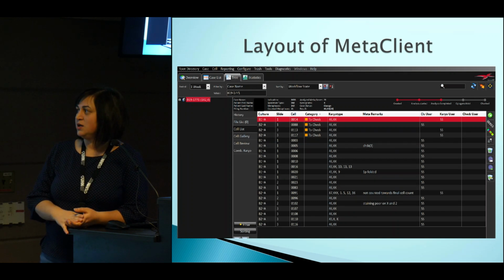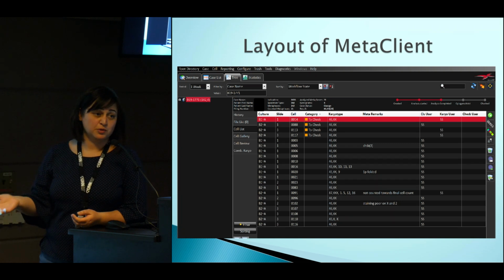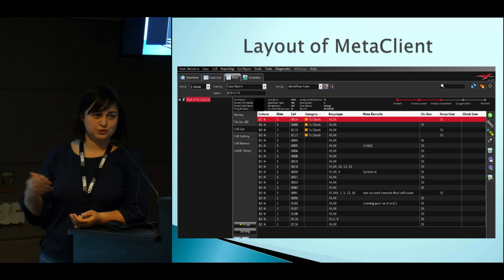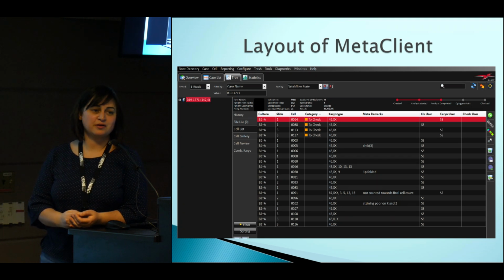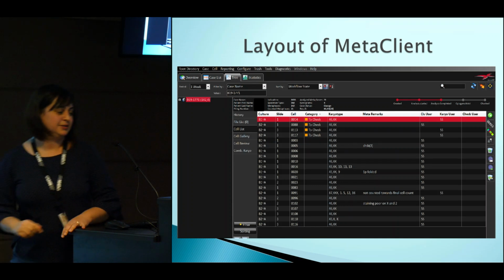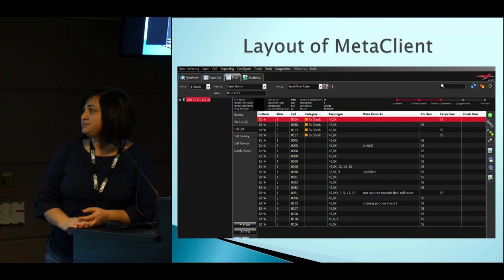And so the analyst would go through a case, analyze a minimum of 20 cells, if they have 20 cells, and then also indicate to the person checking the case which metaphases they should look at, because a checker can't look at all the metaphases, essentially. So that's the category right there to check. So this indicates to the checker, these are the 4 that I'm looking at.